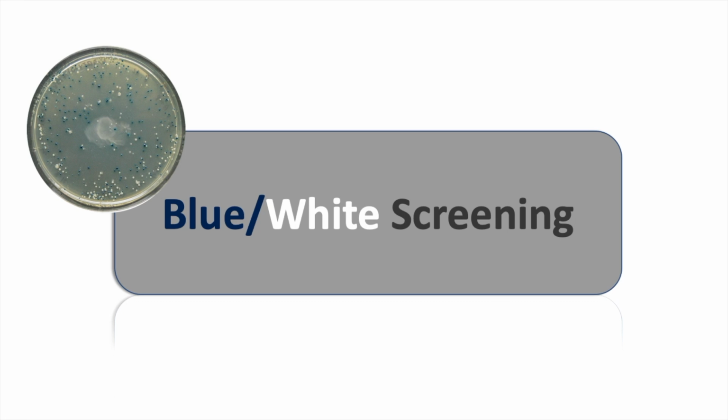Today I'm gonna talk about blue-white screening. I think you'll find this video particularly comprehensive because I am going to go into more detail into the molecular mechanisms that form the basis of this technique. But what is this technique exactly, and what is it based on?